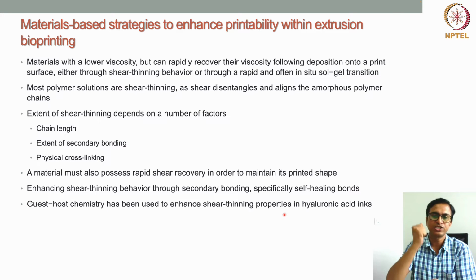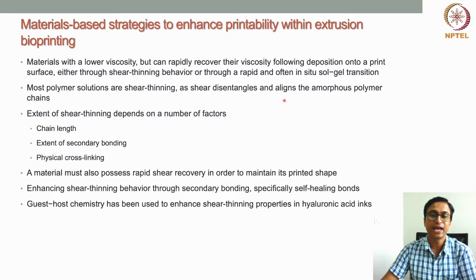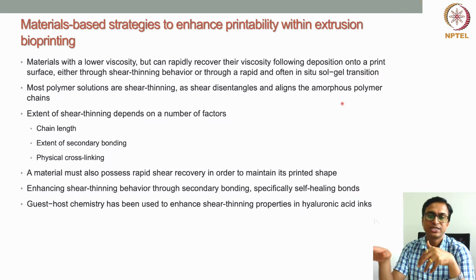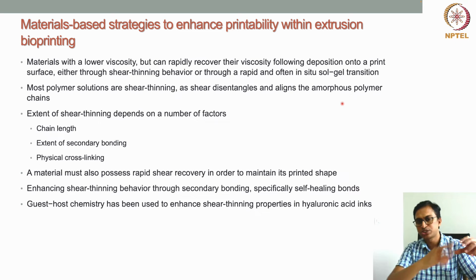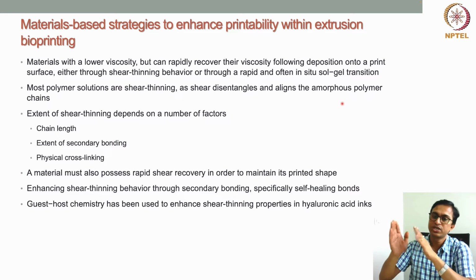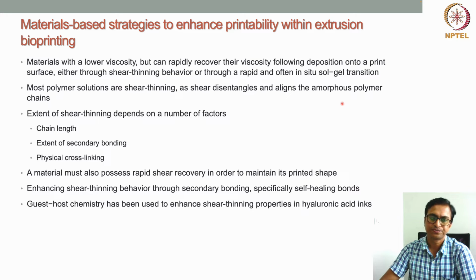But as soon as we apply shear, the shear disentangles the material and aligns the polymer chains towards the extruding direction. So the shear force helps the material disentangle and align the polymer chains, the material can easily pass through the nozzle, and in this way the viscosity comes down.